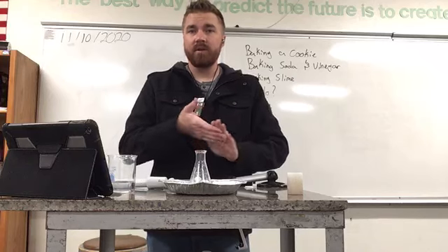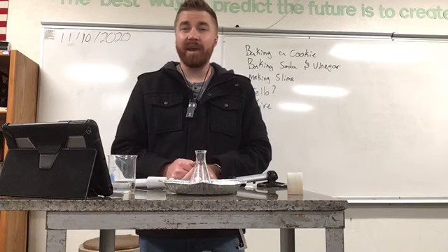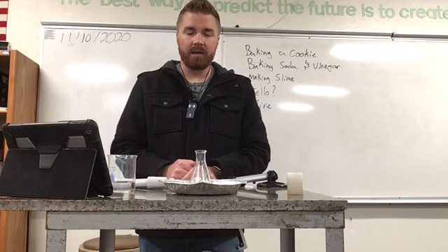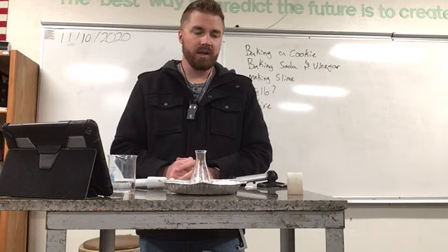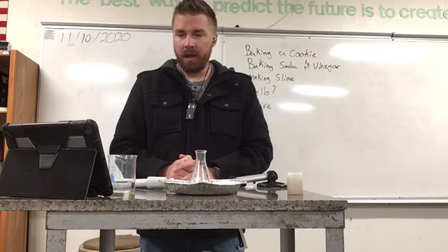Okay, so this video today is meant to accompany the lesson reaction patterns. Now these are all things that we did in the lab, but there's so much it'd kind of be hard to reset up, so I'm making this video so you can see the reactions and be able to do this assignment on your own time.